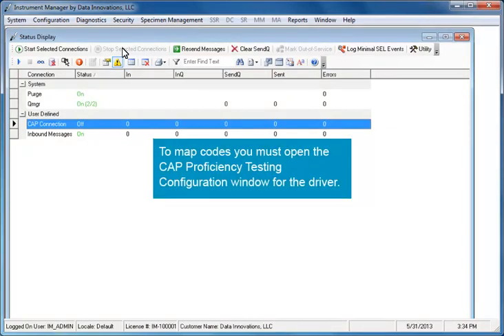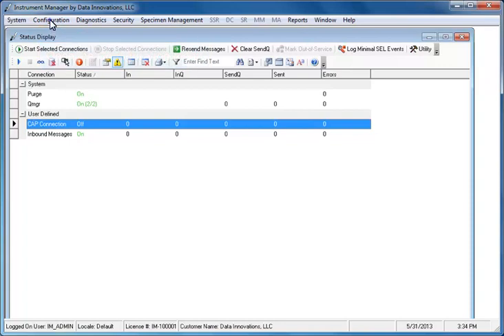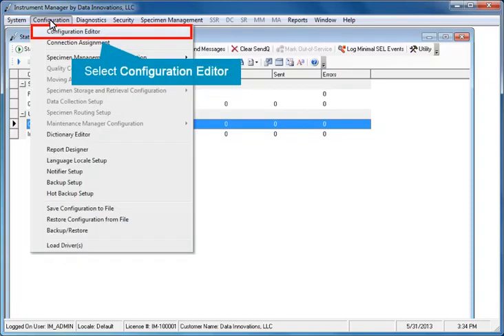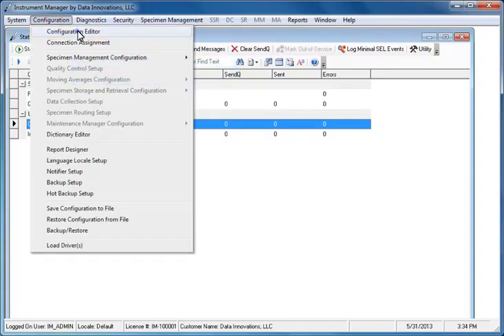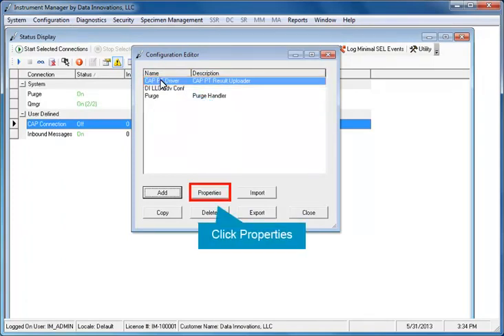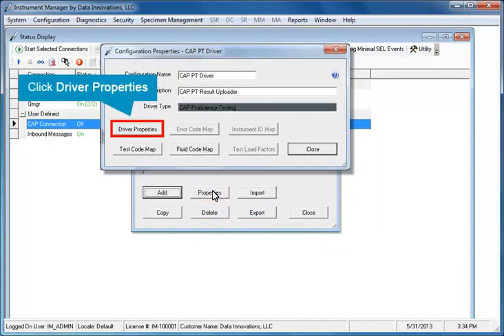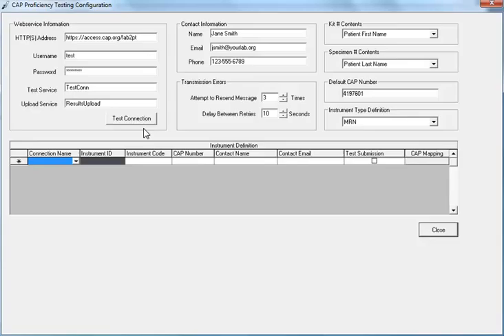To map codes, you must open the CAP proficiency testing configuration window for the driver. Open the Configuration menu and select Configuration Editor. Select the appropriate driver and click the Properties button. In the Configuration Properties dialog, click the Driver Properties button. The CAP proficiency testing configuration dialog opens.